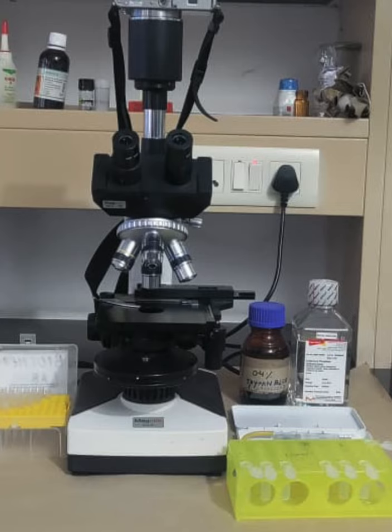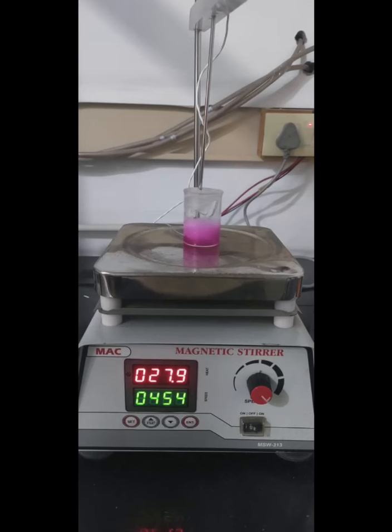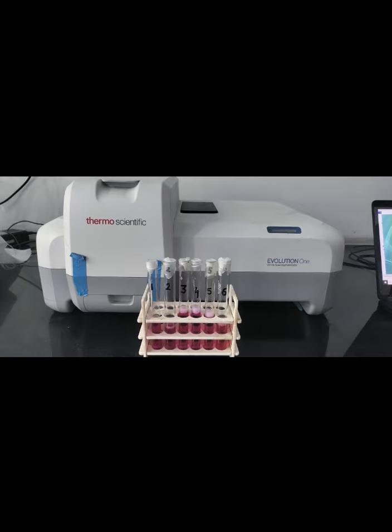blue dye. In order to determine the antioxidant parameters in the cells, we used the same 6 well plate as for trypan blue, and we diluted the cells in all the wells 5 times. After the 5 times dilution, we used these cells as a sample for detection of different antioxidant parameters via spectrophotometry.